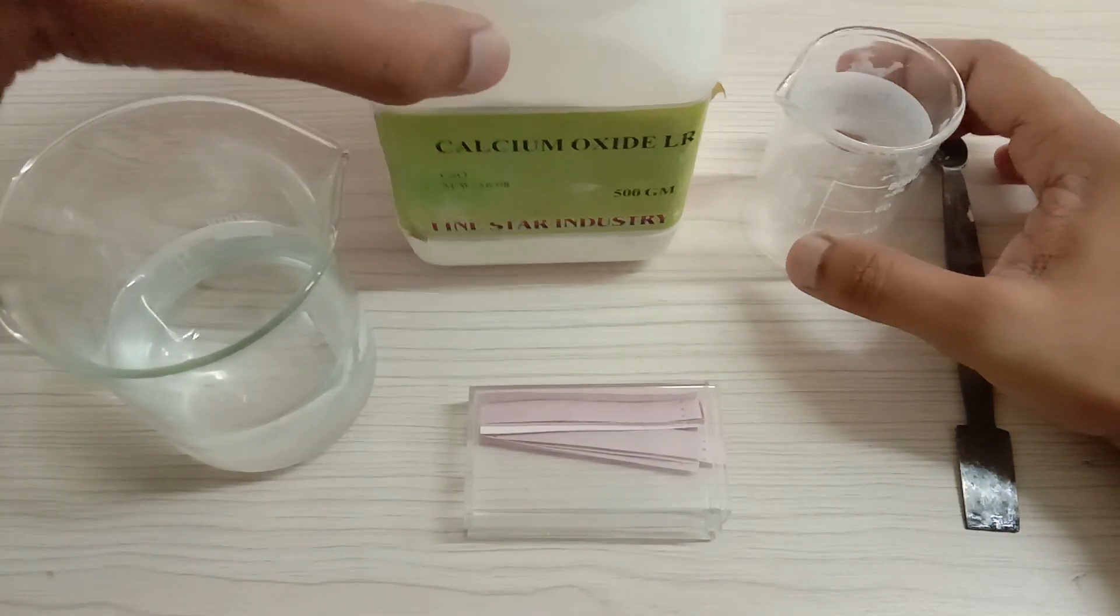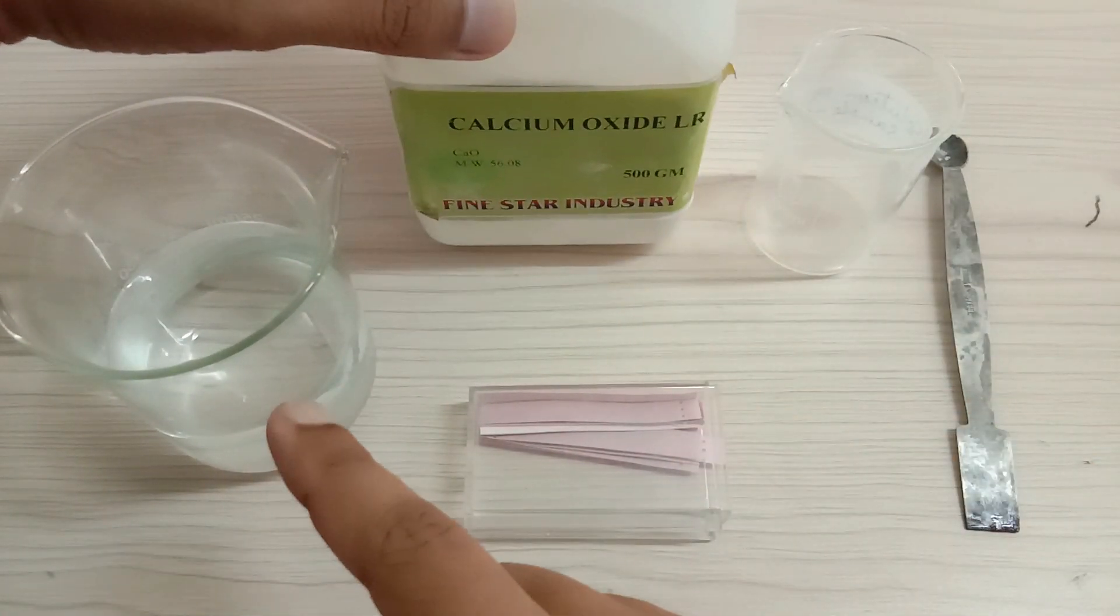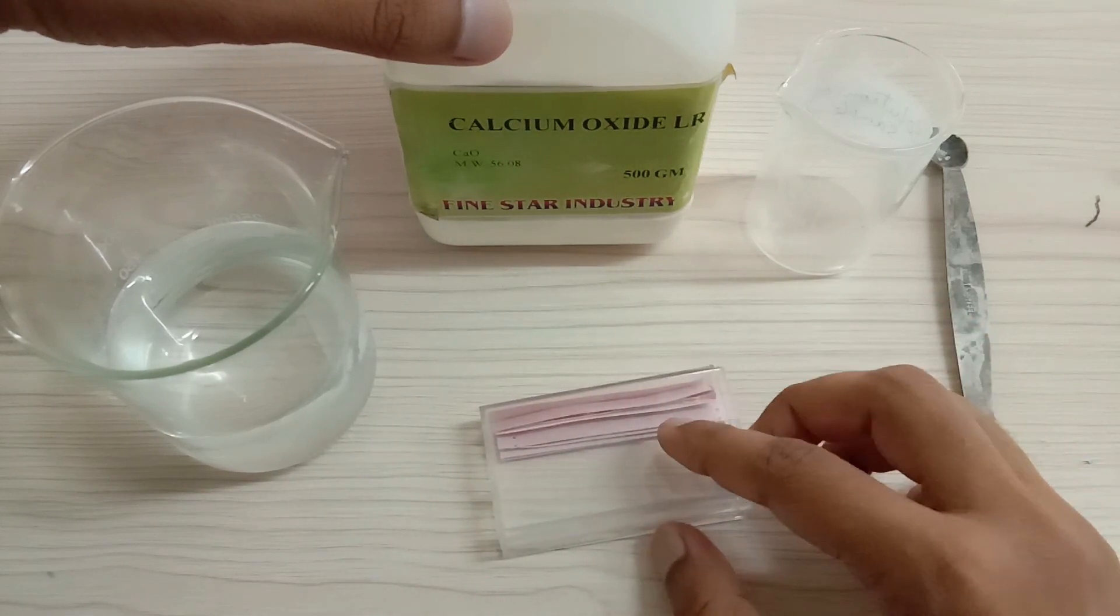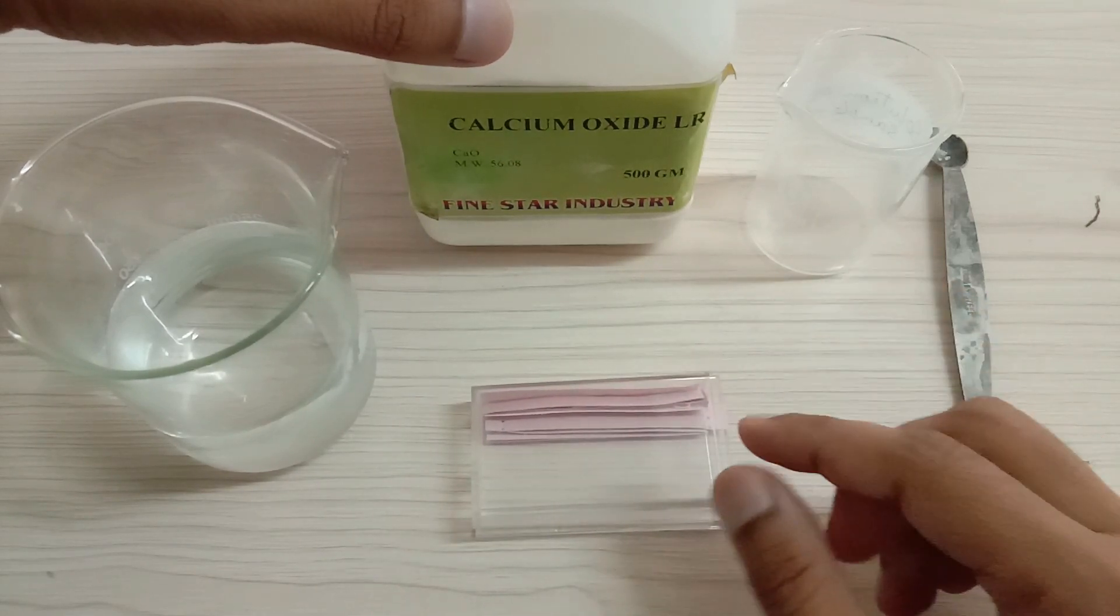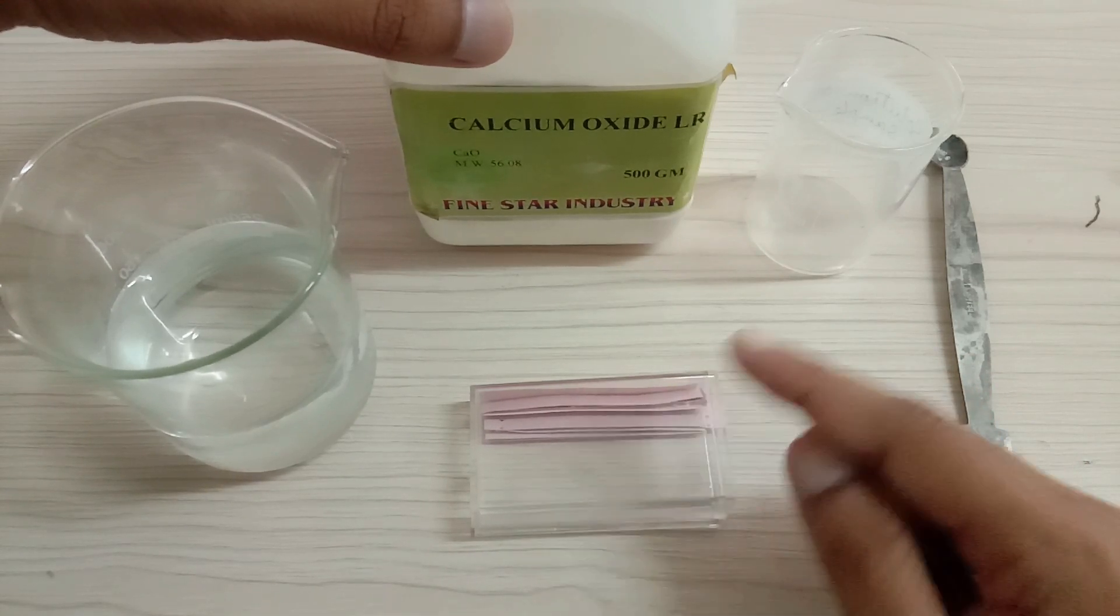For this experiment we require calcium oxide powder, that is CaO. We require some water, and I have some red litmus paper because after the base is formed, calcium hydroxide, the red litmus would turn blue.